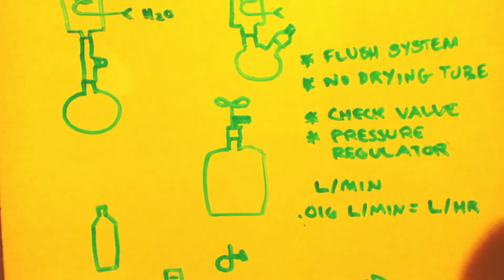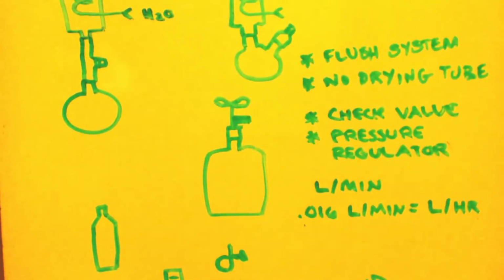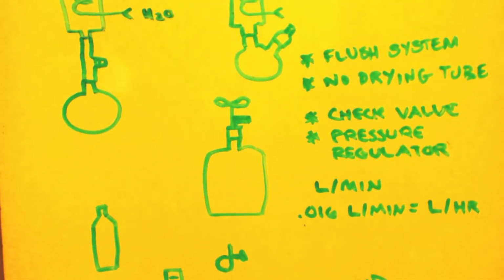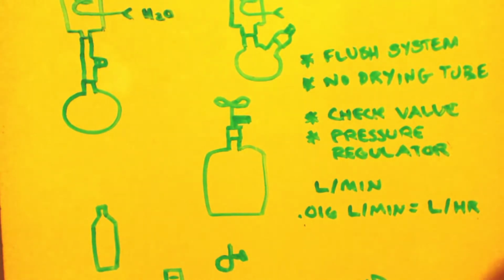You're refluxing for 90 minutes. So within the first hour, you would fill up that empty space. Because remember, you only got a liter of empty space, right? You would fill that up within that hour, and then the next half hour you'd fill up another half a liter, okay? I don't know how they're rated or what they're rated at. You'd have to look into that. Going over some stuff here that I'm guessing at, basically. That's what I would try to rate it at if I could, okay?